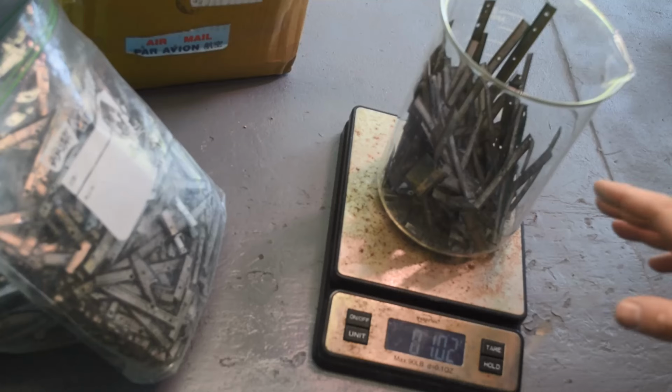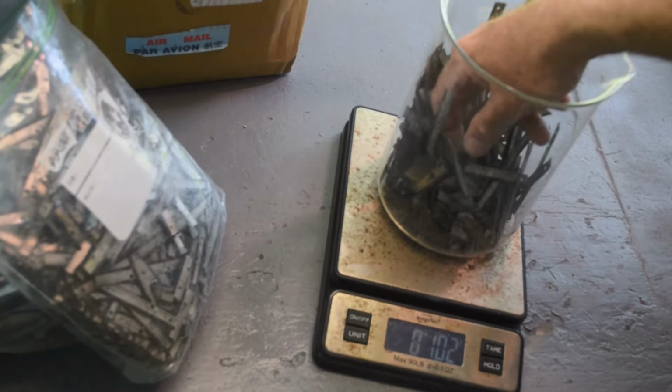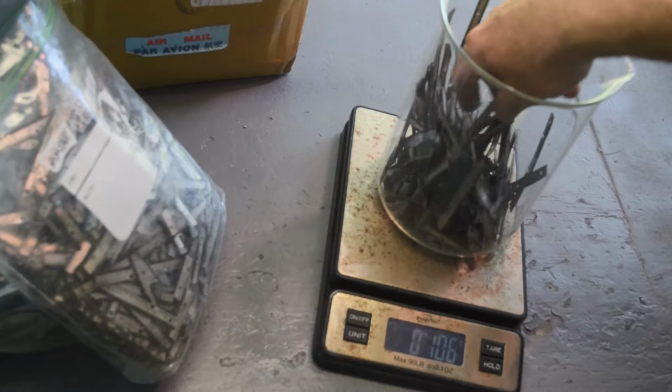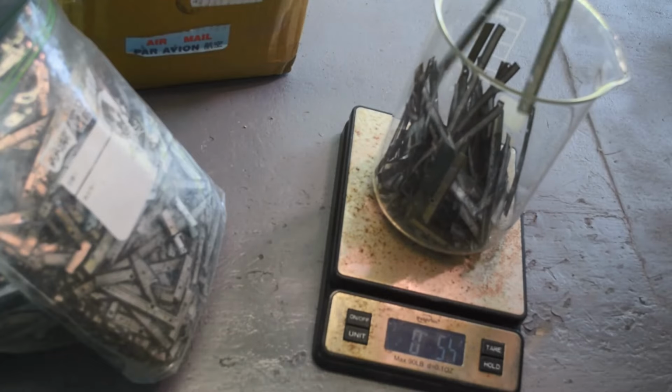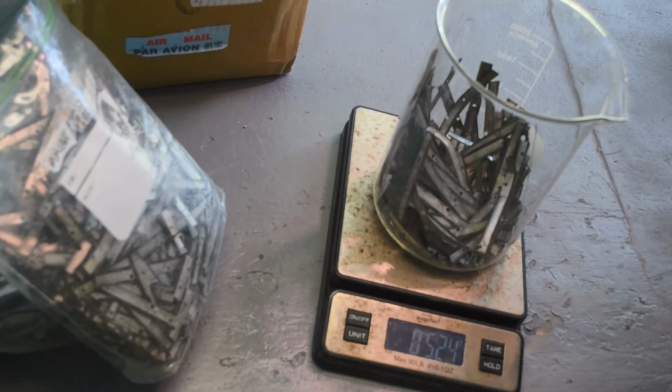So if there's palladium in it, nitric acid should dissolve it. And then we can do a stannous chloride test and see if there's any color of palladium. So that's what I'm going to do. Let me get this in the fume hood, and we will treat it with some nitric acid and see what we get.